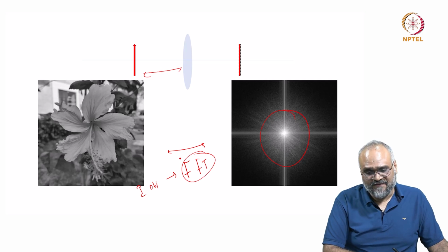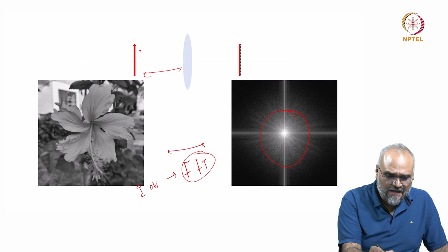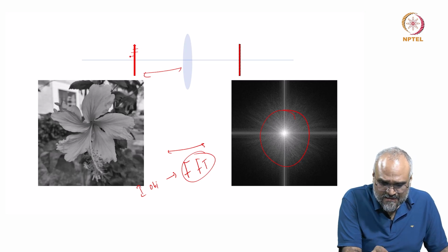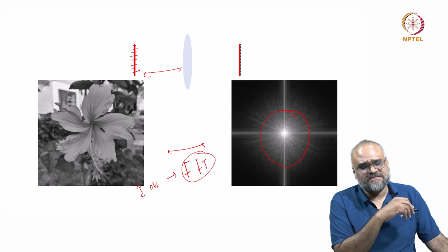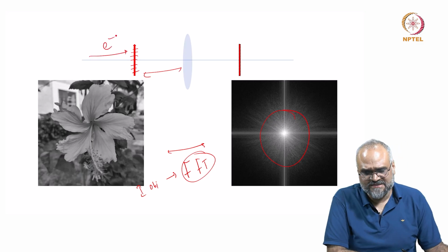Now, if I use the same logic, I can relate the crystallographic planes which are oriented parallel to the electron beam, as we saw in the previous slide.